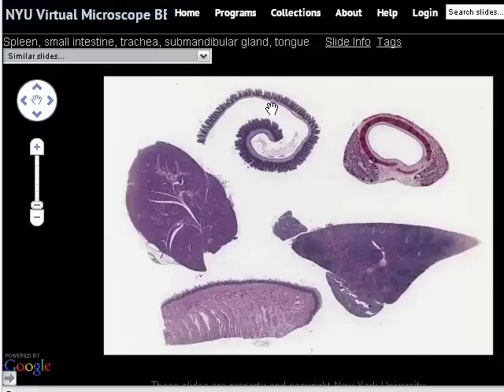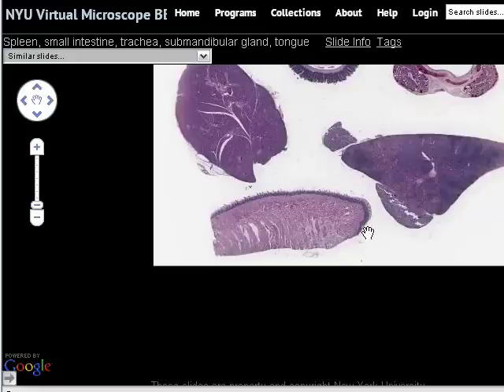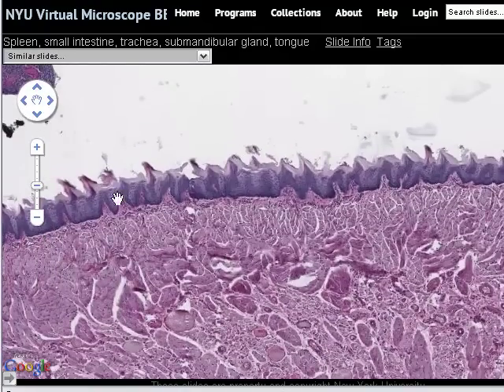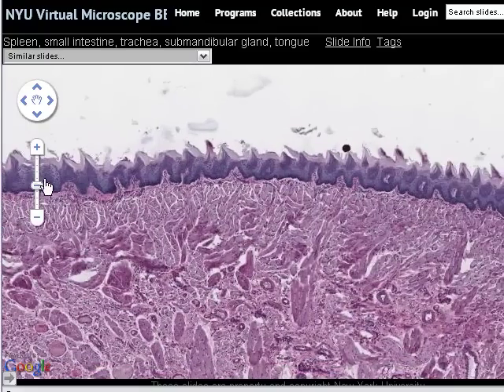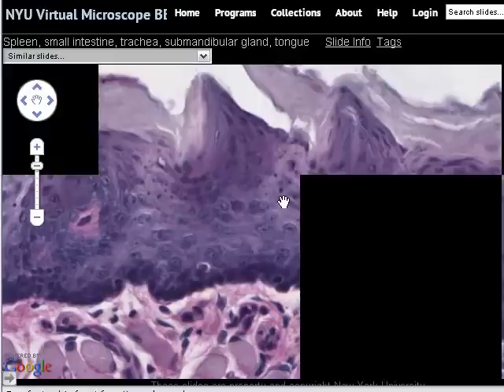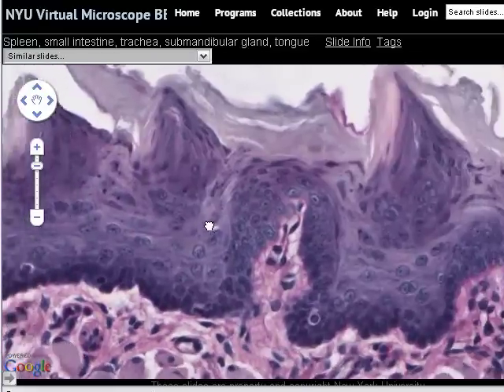Now we're going to look at the last section on the multi-tissue slide — a piece of tongue. The epithelial surface of the tongue is this surface here at low magnification. We'll go up in magnification slightly. Here's the epithelial surface of the tongue, and rather than me tell you what the epithelium is, I'd like you to examine the epithelium across its length and decide if you can classify it based on what you've learned about epithelium so far.